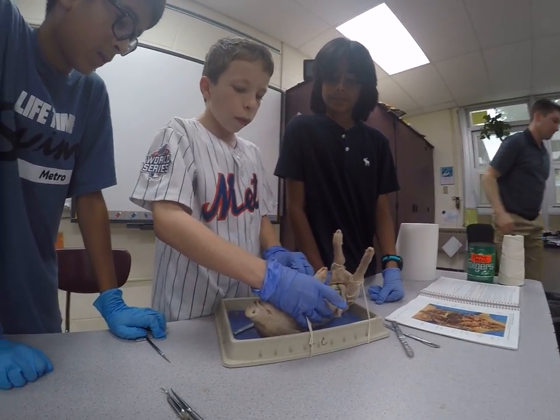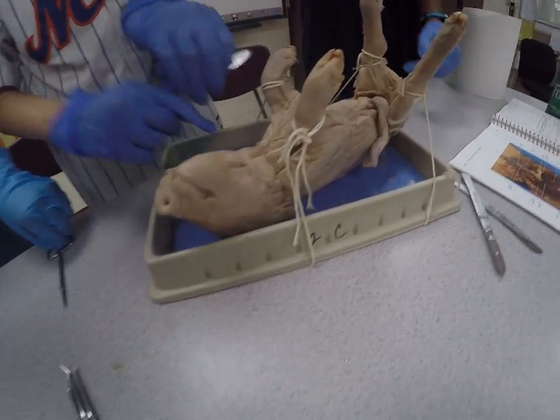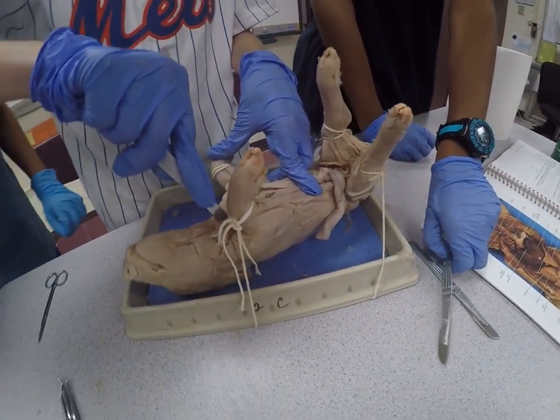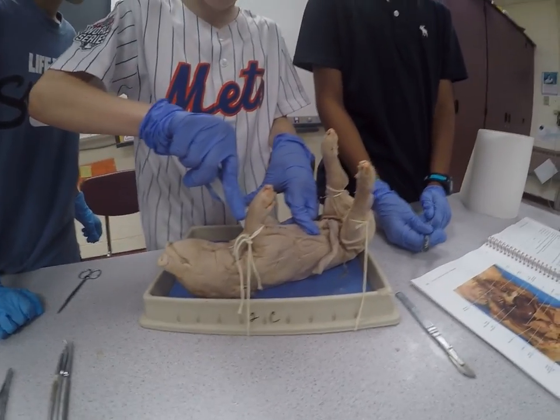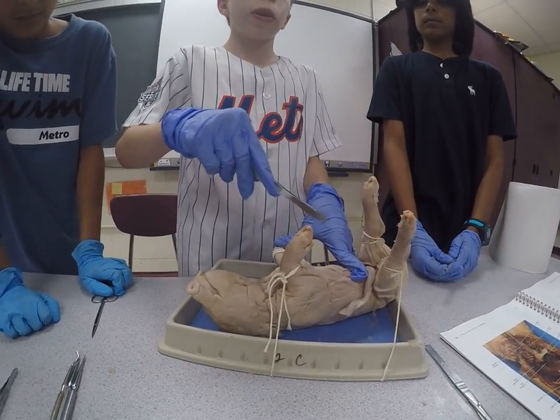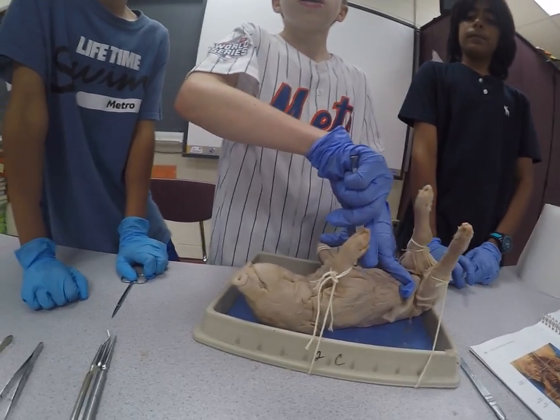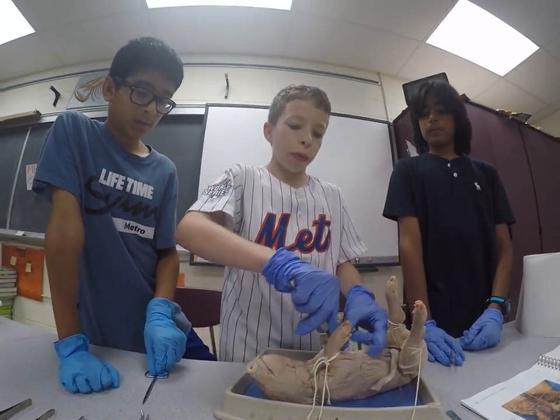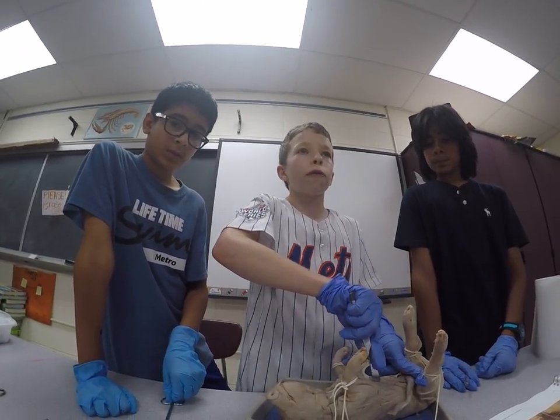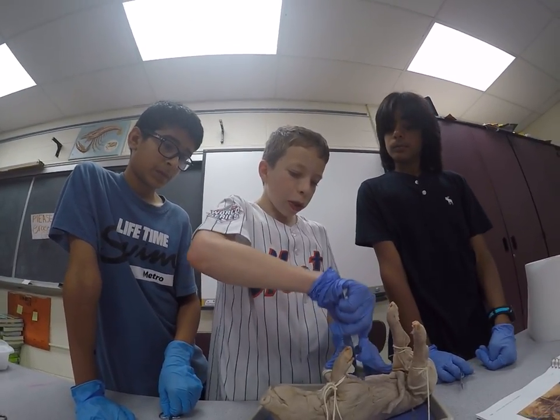This is also where the rib cage is — right here is where we're cutting into on the pig. The reason we're using a scalpel is that when you guys dissect, you will not be using a scalpel, only scissors, because most of what you'll be dissecting doesn't have a fully formed rib cage. You'll just cut through a layer of skin and muscle with scissors, which will be much easier.